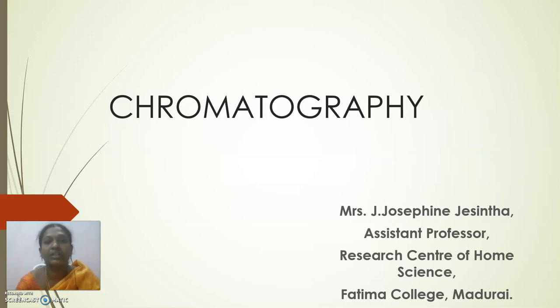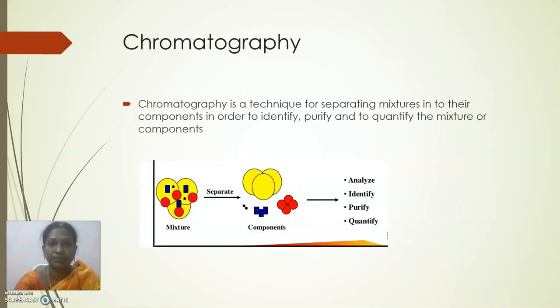So, chromatography is an analytical technique which helps in the separation of the components, and it is one of the most important analytical procedures which is carried out in the lab. If the mixture contains different compounds, chromatography helps in separating the components according to their structure or their size. So let's see one by one.